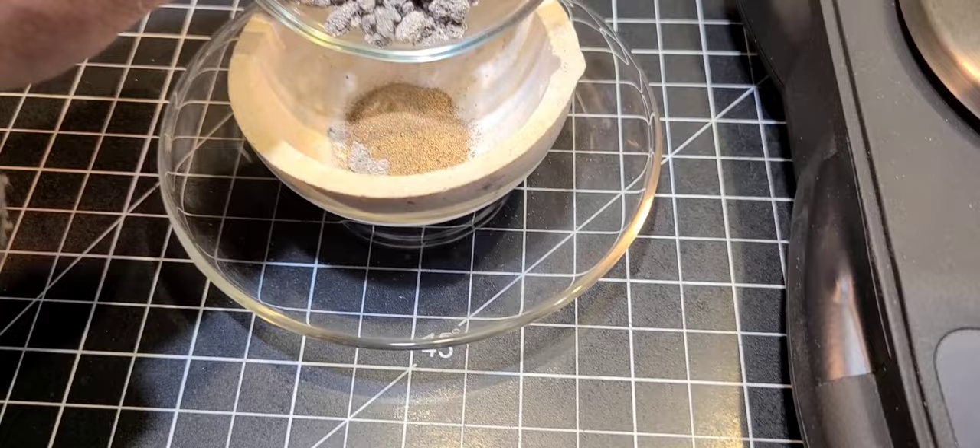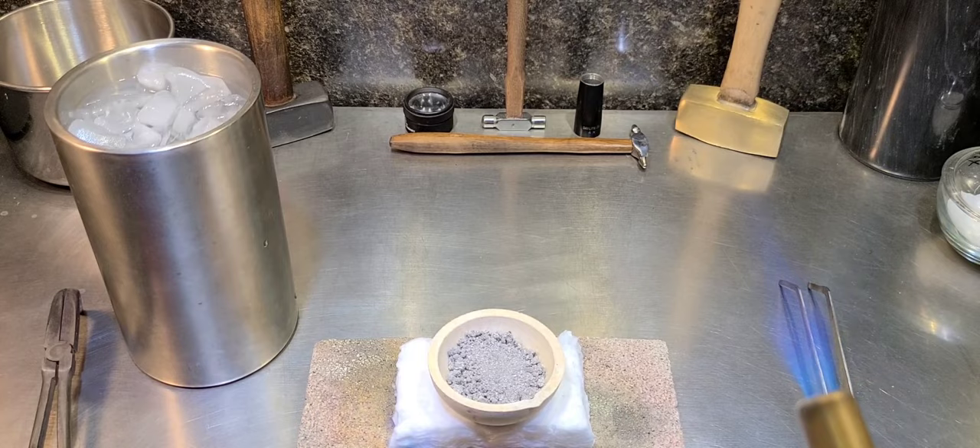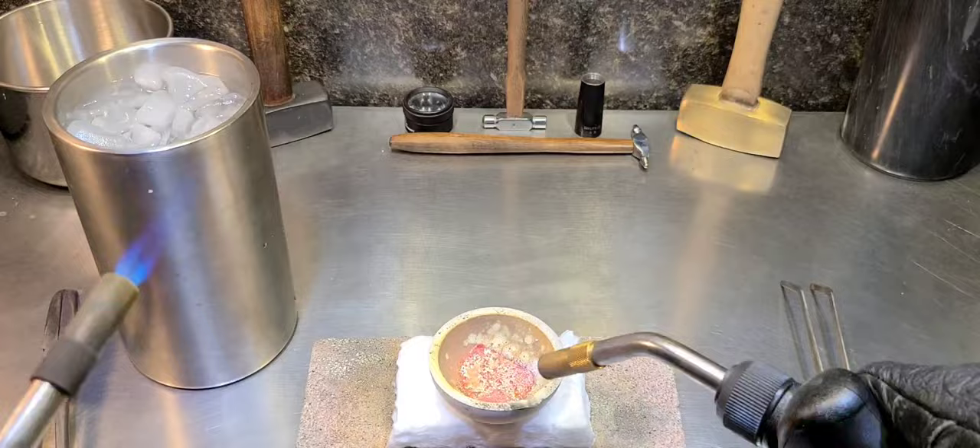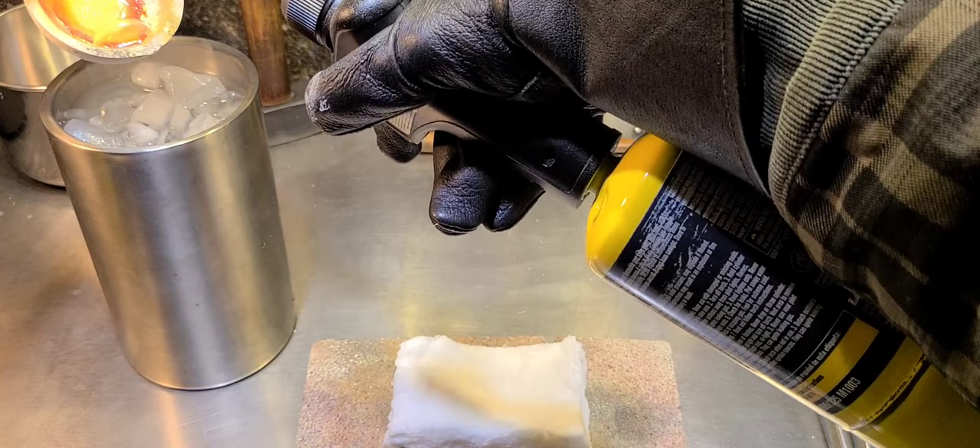So that means we're going to need about 30 grams of silver — it's a little overkill — to inquart this gold with. By inquarting, I'm making an alloy of approximately 25% gold. So we'll get this melted down here. I'm going to speed a lot of this footage up to save us some time.